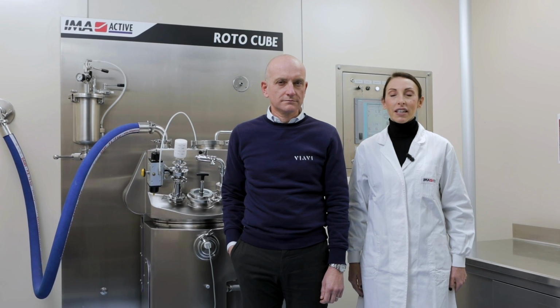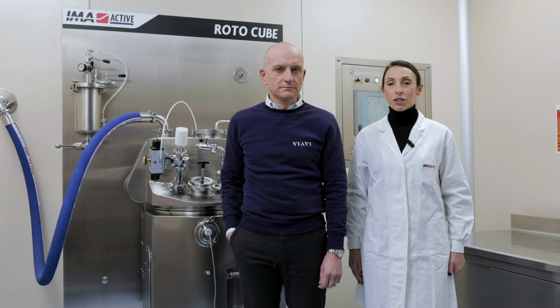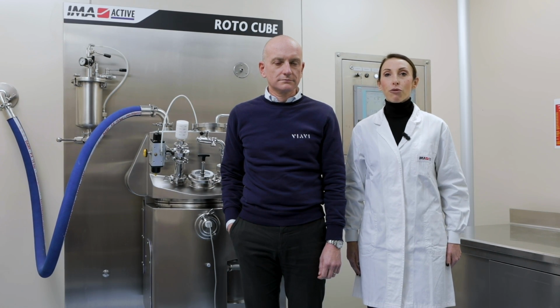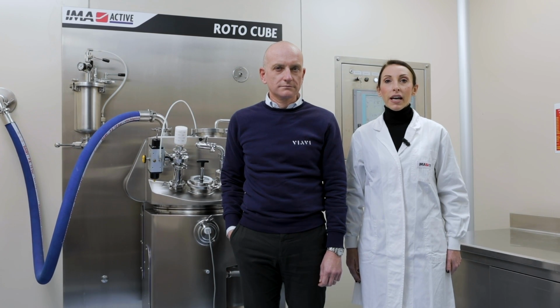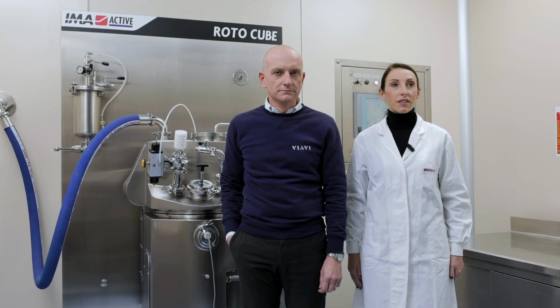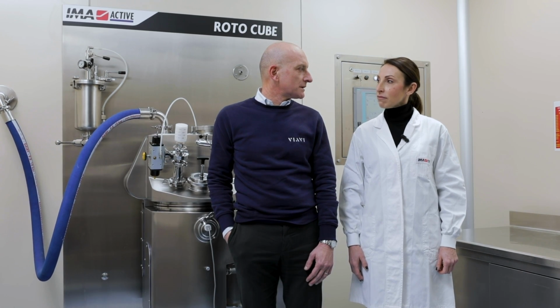Granulation is the crucial first step in creating a robust, solid oral dosage form. Wet granulation in high shear is the most preferred method in creating high-quality granules, suitable for tablet compression and capsule filling formulations. Although this method is well established, the identification of endpoint during each phase of the process is still challenging. Giusy, what is exactly the definition of the endpoint in the granulation process?